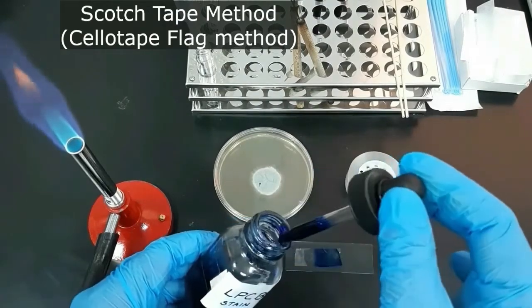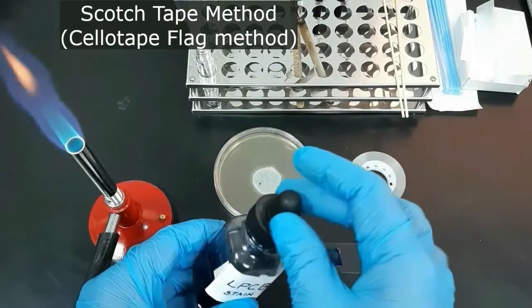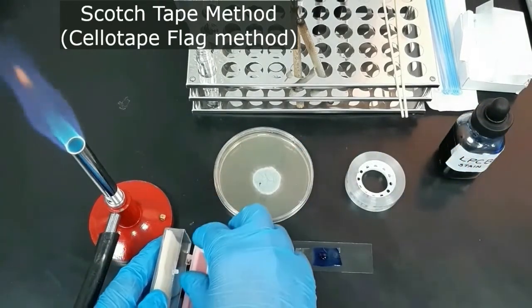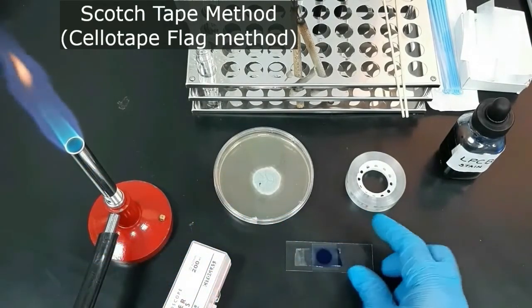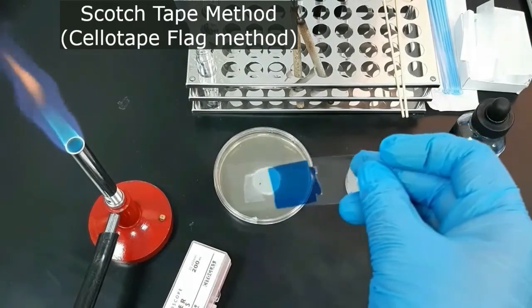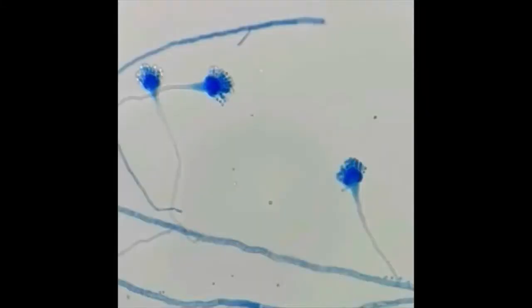Add another drop of the stain on top of the tape and cover it with the cover slip, then observe it under the microscope. The cellar tape flag method is a good and easy technique to see the fungal structures.